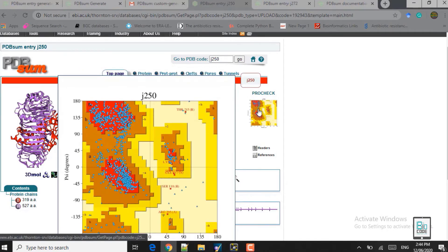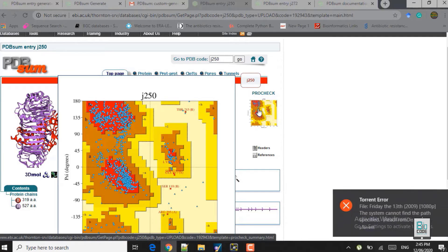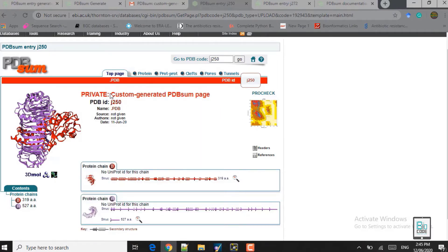This section provides the Procheck results. The Procheck generates a Ramachandran plot for the provided structures. In the red area you see the favored region, the brown area denotes the allowed region, the yellow area denotes the generously allowed region, and the white area is the disallowed region. We prefer it when most of the residues fall in the brown and red areas.